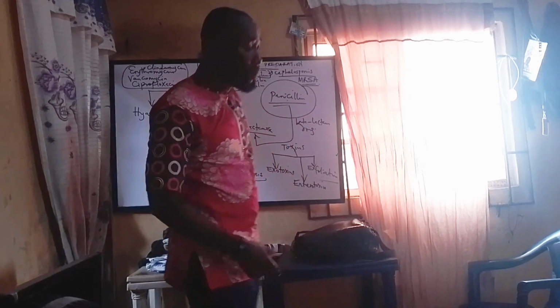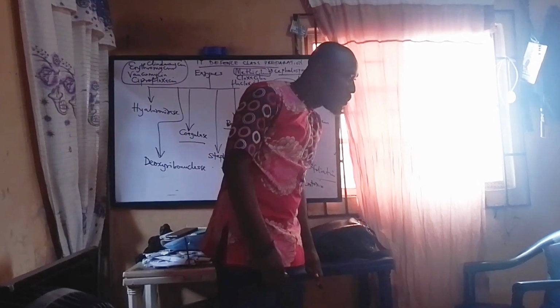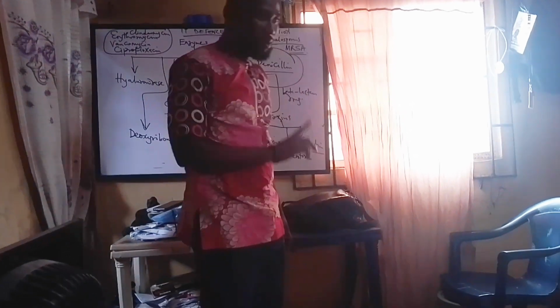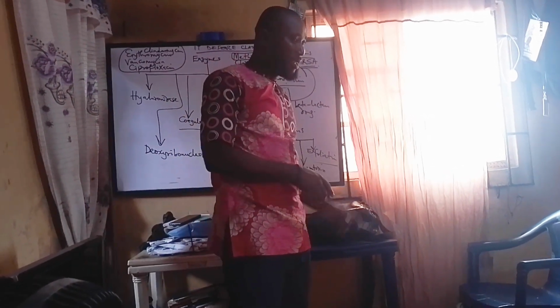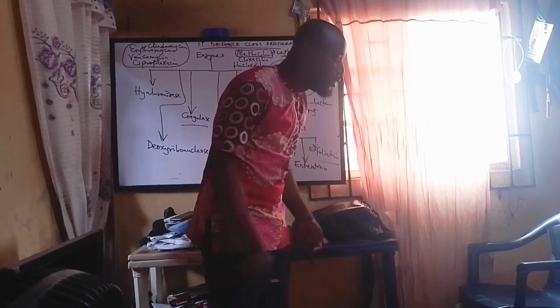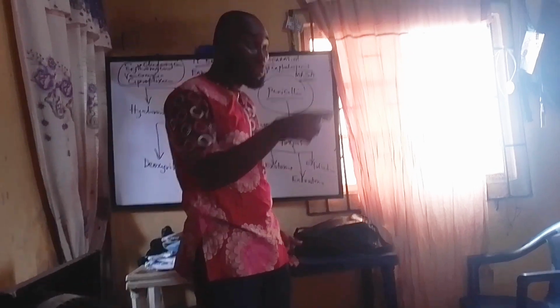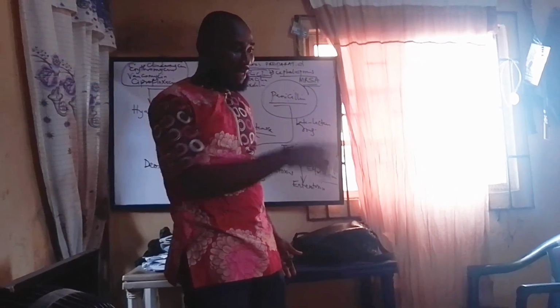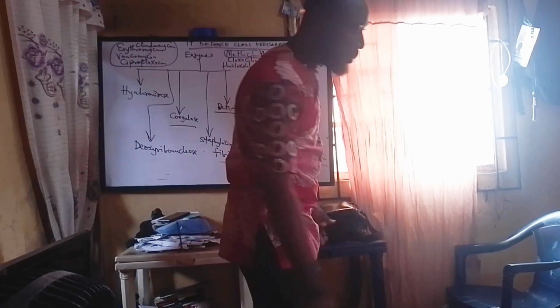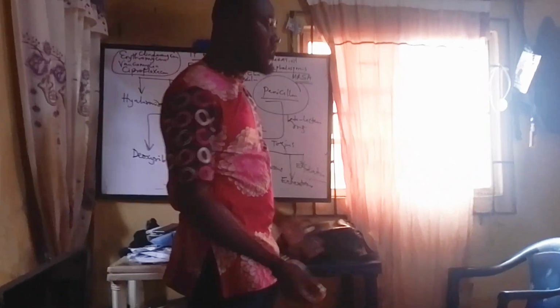Because they can ask you, after collecting the sample using stick swab, did you use pour plate method or spread method? If you say pour plate, I say, is it liquid? How do you pour it? You can't pour it now. You see, that's how lecturers twist questions. They want to know if you know what you are saying. If you say you pour the stick swab, what did you pour inside? They say you are lying, you don't know what you're saying. That one, you use streak method.